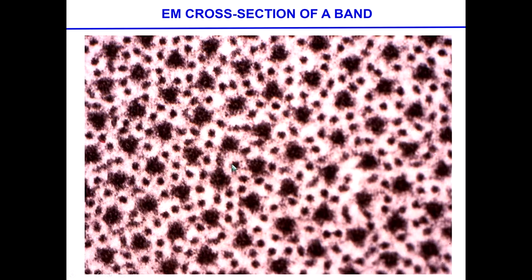This is another way of showing you the same, and this shows more of the imperfections that I was talking about. Things might be a little bit disorganized because when you cut a section, I suppose you have studied all the histological techniques, and they're masters in the system, right? But to be able to do the sectioning and the staining, one of the first things you need to do is put the sample of the tissue, most of the time, in something as nasty as formaldehyde.